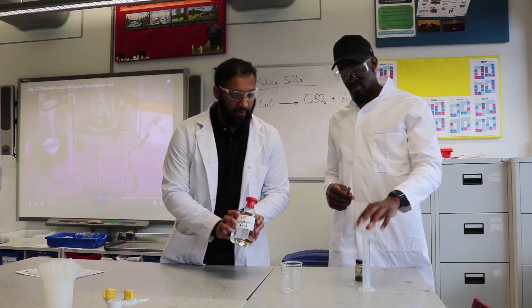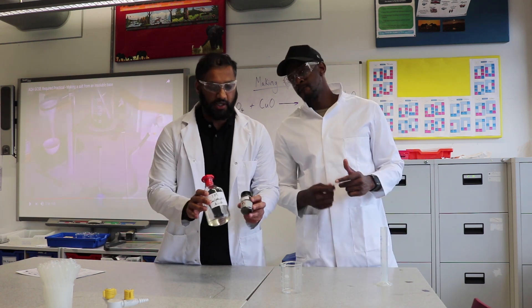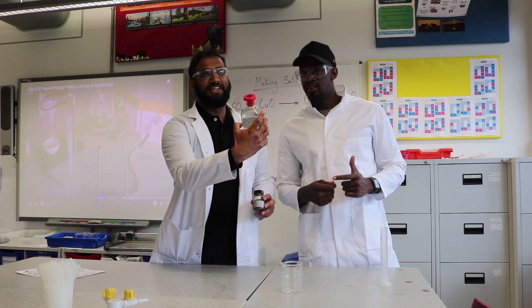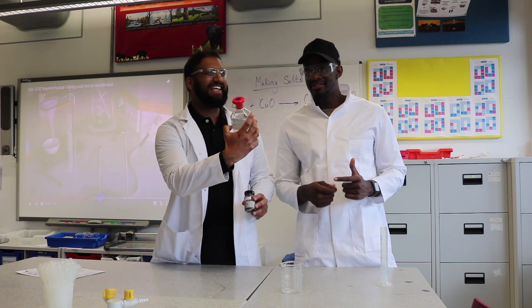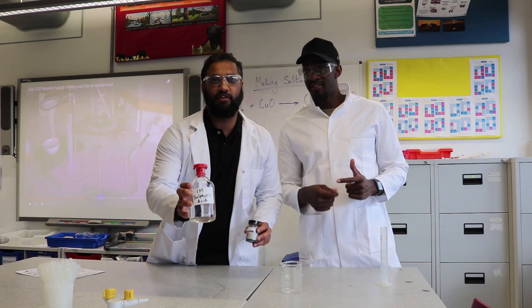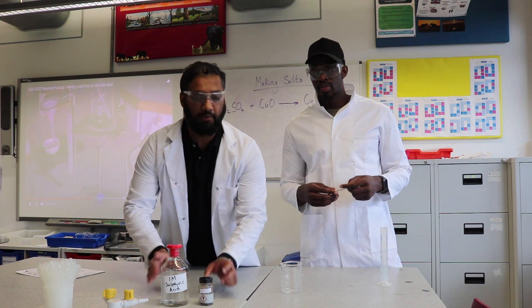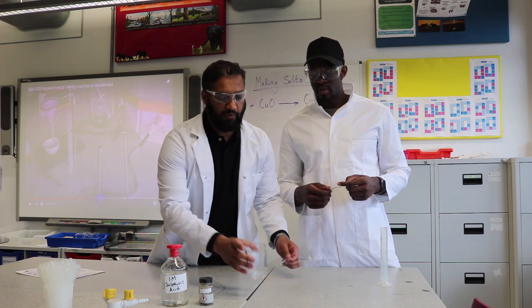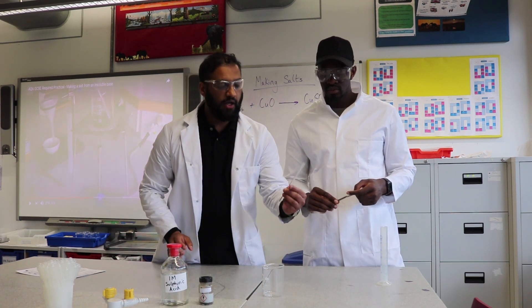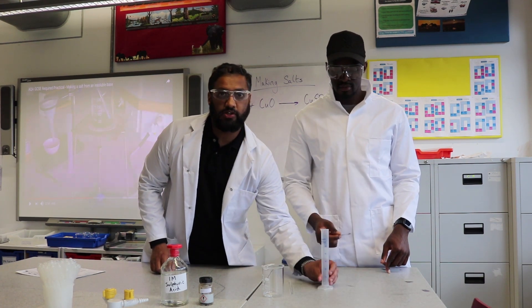It's very important you understand what the equipment is all about. We have two reactants: sulfuric acid and copper oxide. The apparatus includes a beaker, a stirring rod, a spatula, and a measuring cylinder.